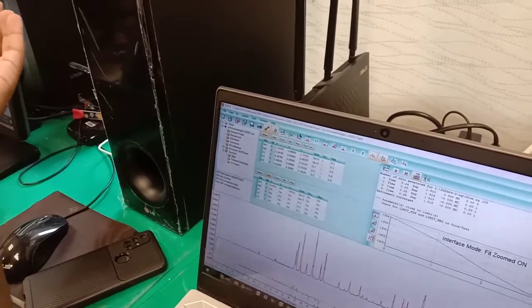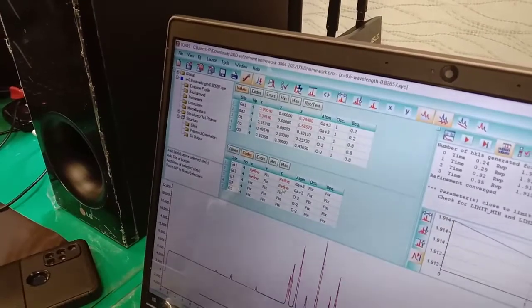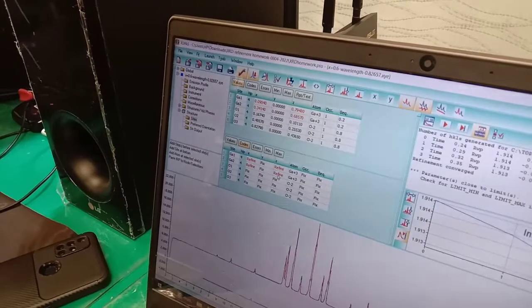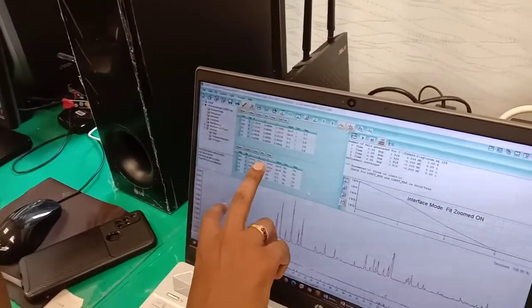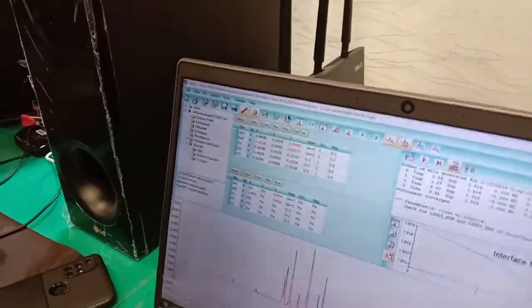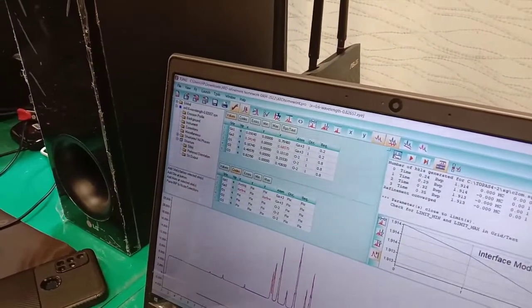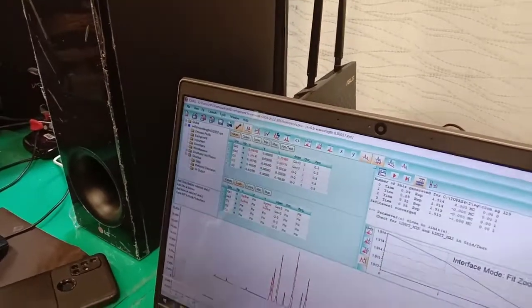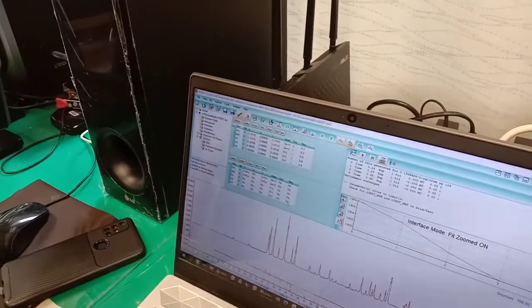Okay, I can also choose this kind of thing. Strategy is basically up to you, and it will change system to system, whether I have to choose only gallium 1 and refine it. Basically normally we choose gallium 1 and we refine. After that we fix this one and we choose gallium 2 and we refine it, and later on we will open both sides and refine it. It's up to you, but whatever your case, finally you have to open every site and refine it.